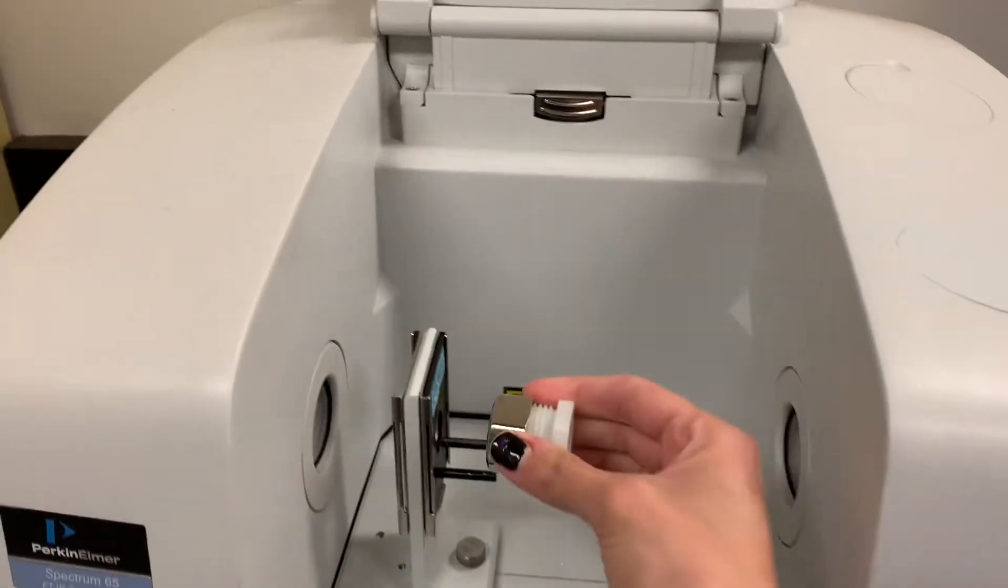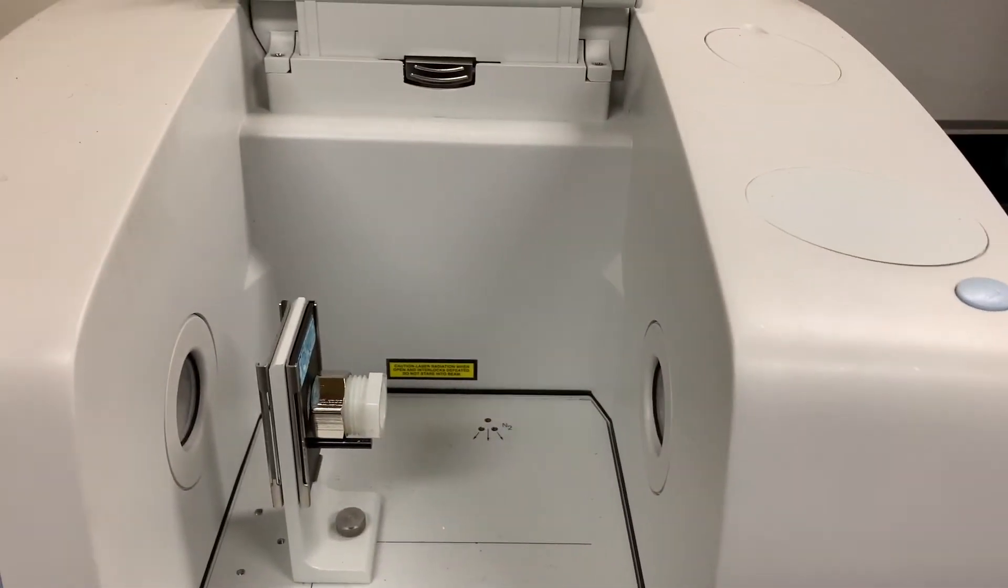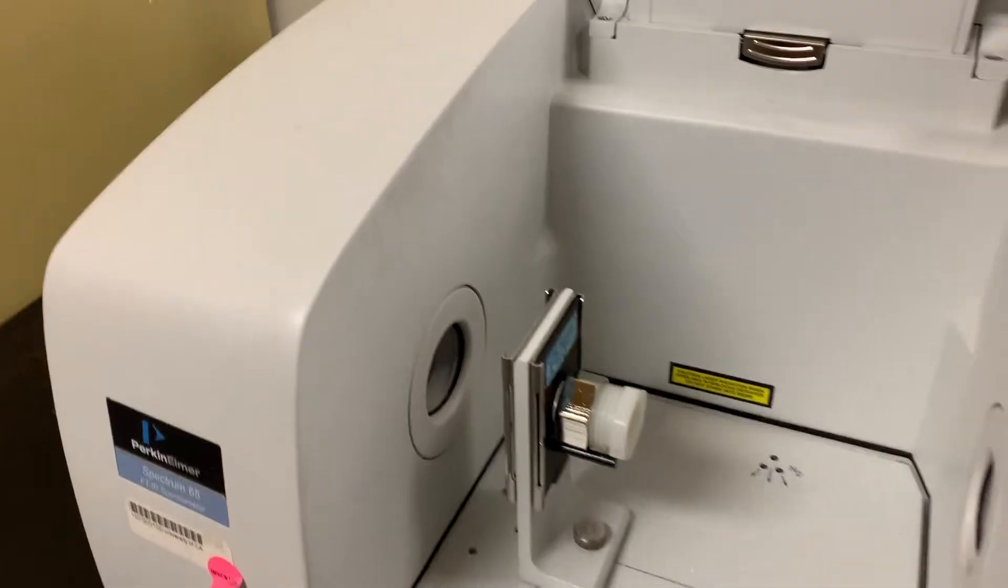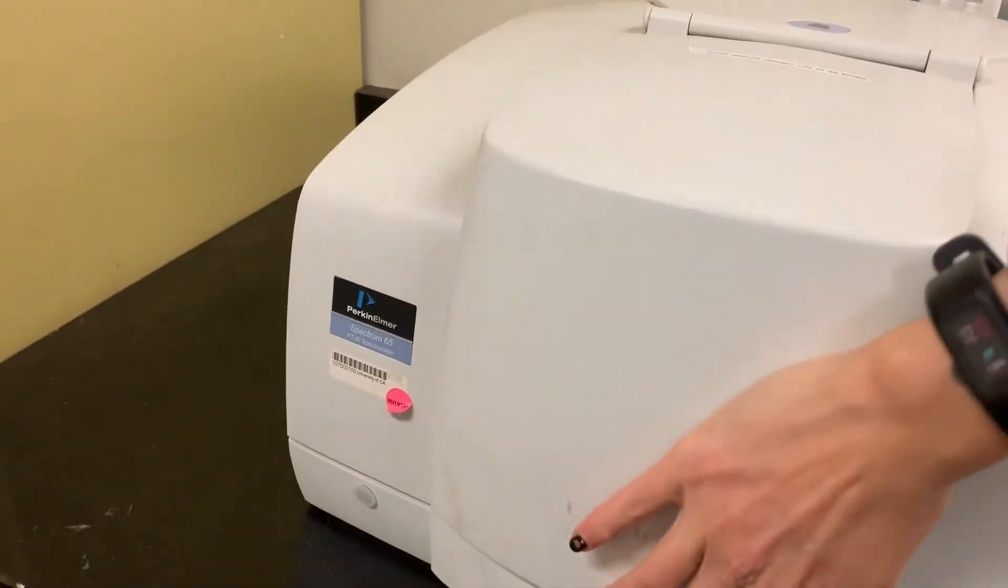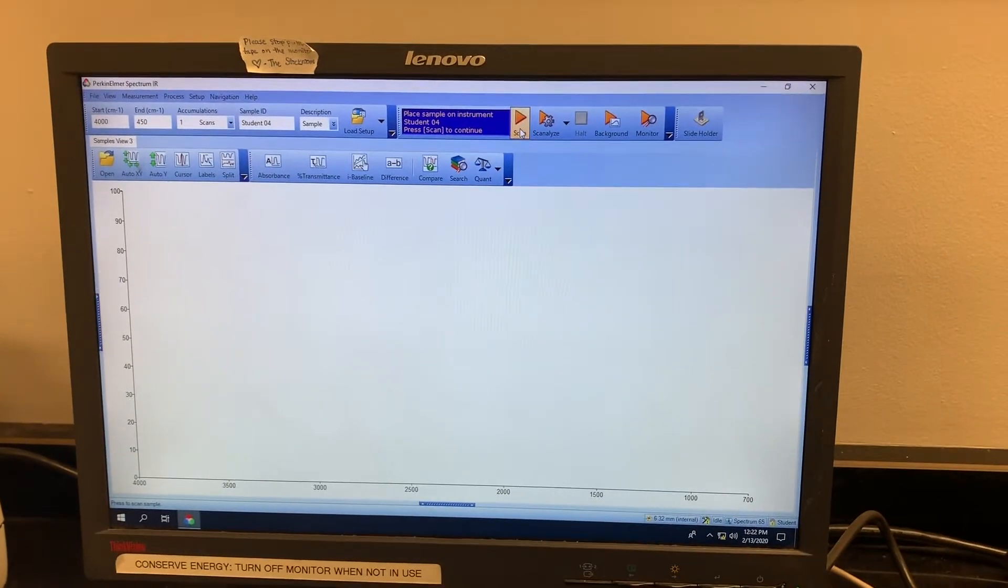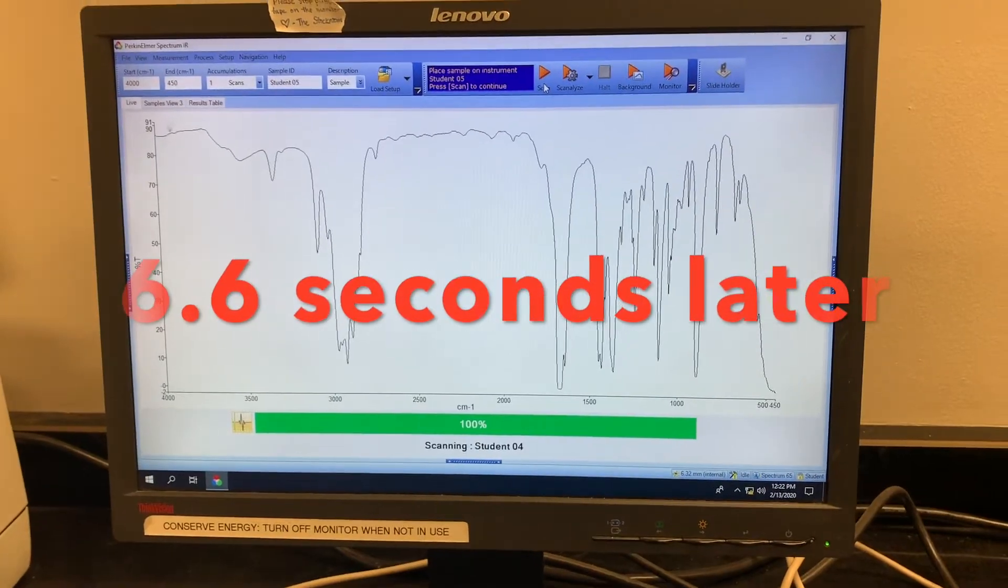We're going to place this guy here, just like that, close, simply hit the scan button. All right, cool, so this is Carvone.